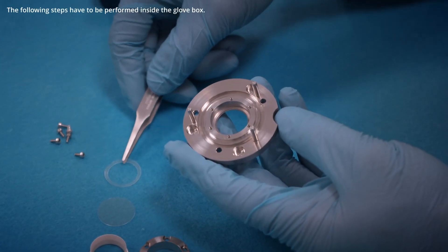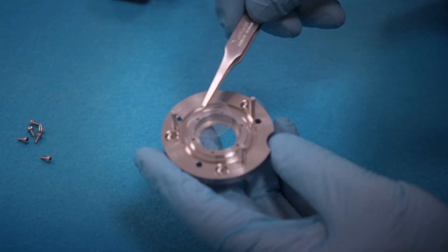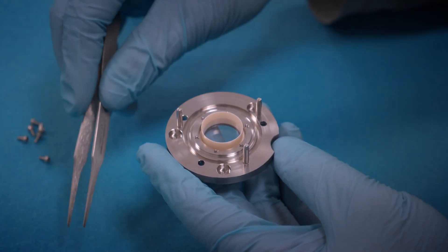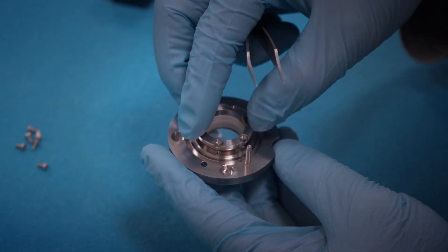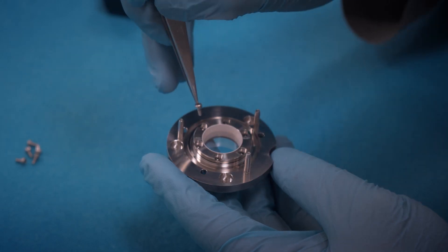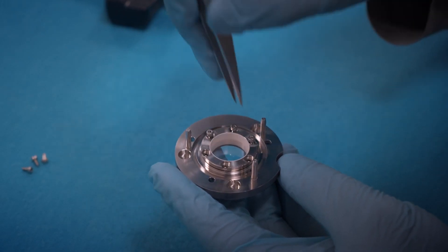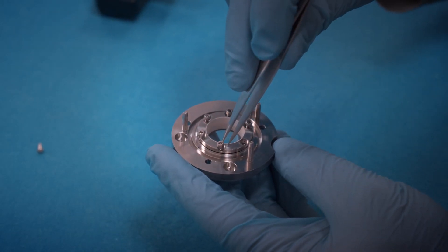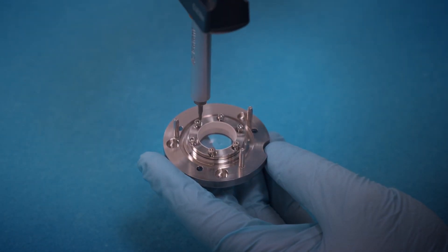We start with the assembly of the cell lid, insert the polyethylene seal, then the sapphire window, this plastic ring, and finally the flange holding the window in place. The flange is fixed using six screws and the provided torque-controlled screwdriver.